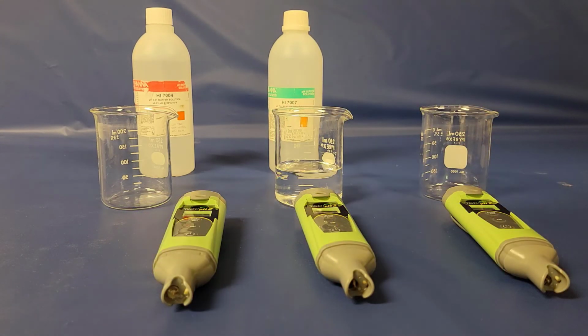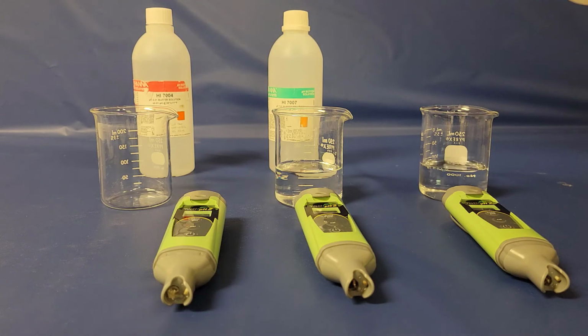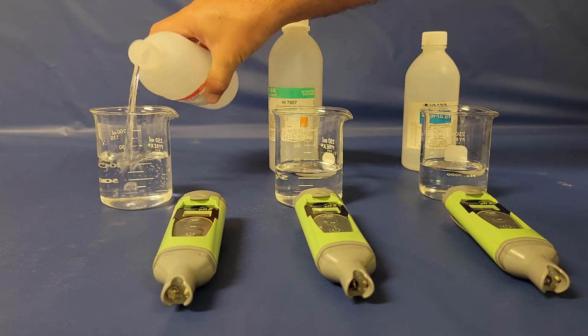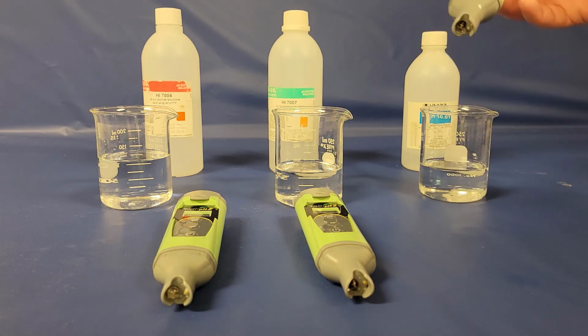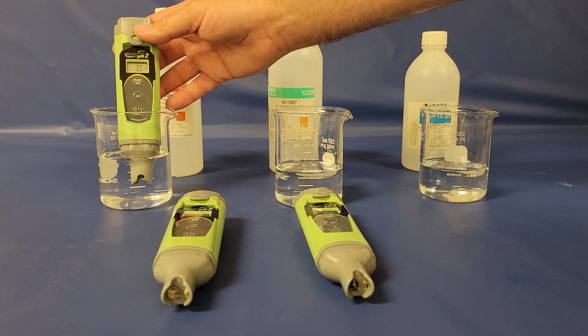So now let's go ahead and check what it is at 10 and 4 here. So we're just going to pour in some solution here. Again, about 1 inch of 10 and 4. All right, so let's go ahead and check it in 4. So we'll check our first sensor in 4. You can see there it's reading about 3.5, so it's reading a little low.